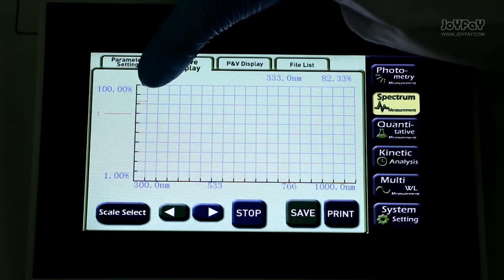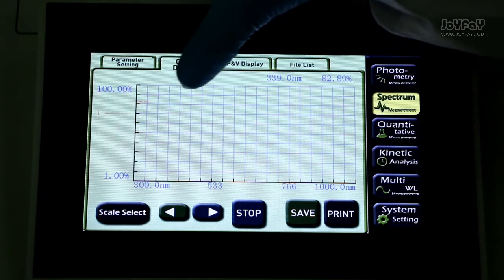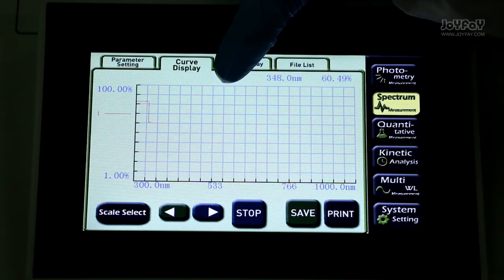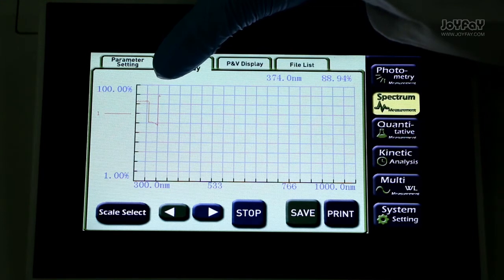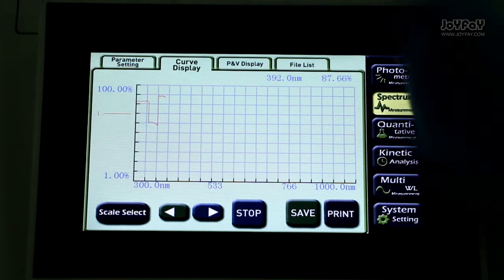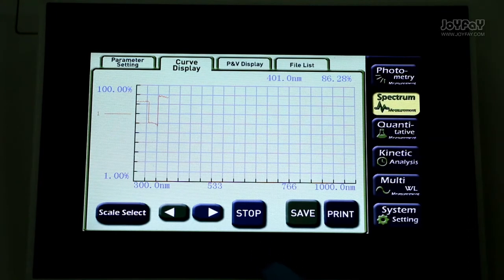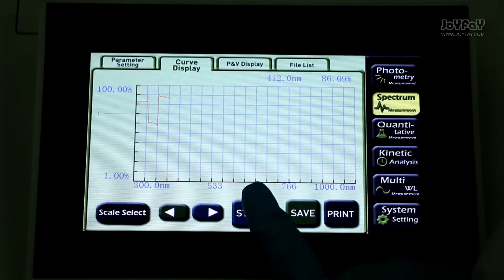The testing process will be shown in curve display. Press stop to stop the testing.